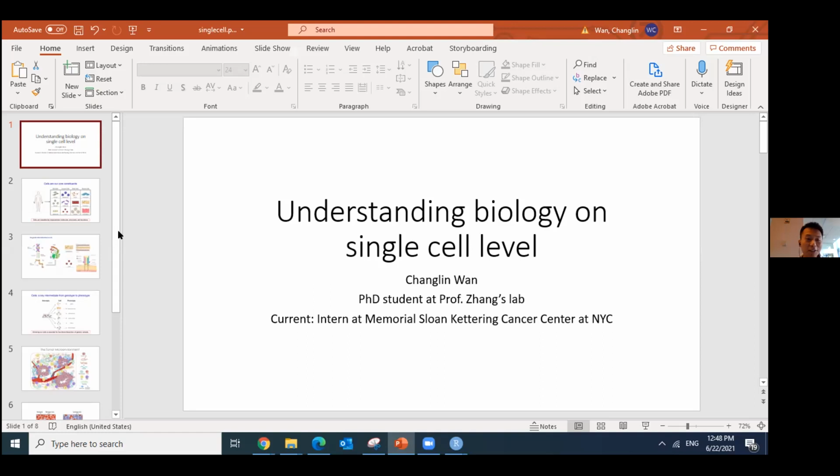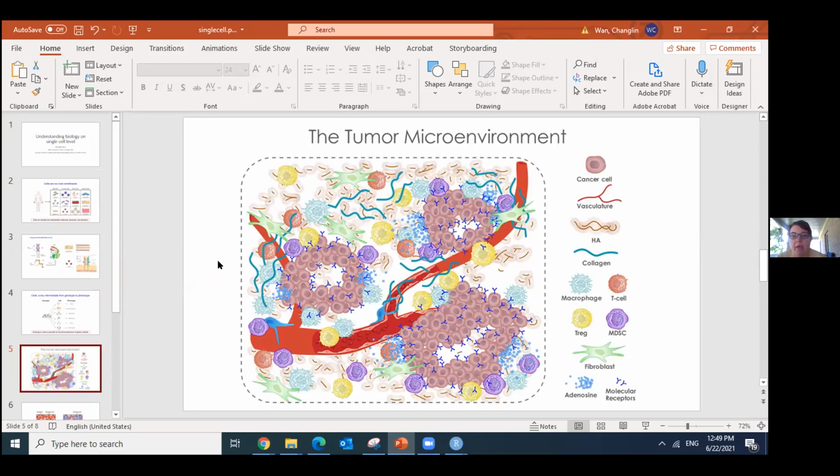So with cancer cells, like a tumor, basically, if you run that sample through the fluidic system, you can understand how many different cell types there are and what their gene activity is in each of those cell types, and then possibly develop a treatment, like a more personalized medicine treatment based on the person's unique tumor?